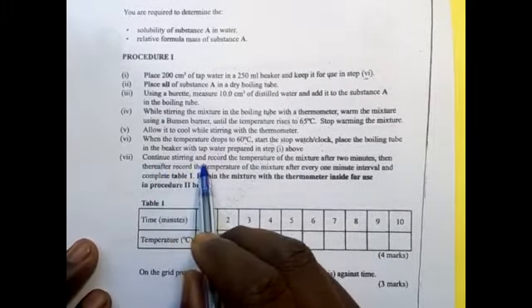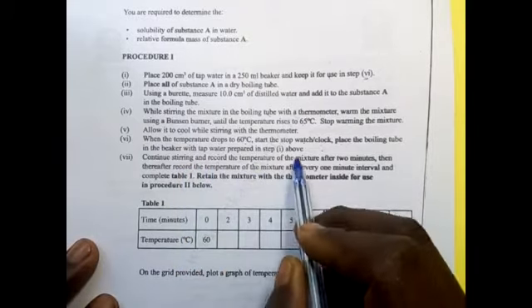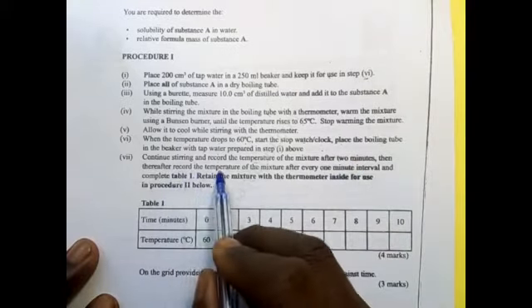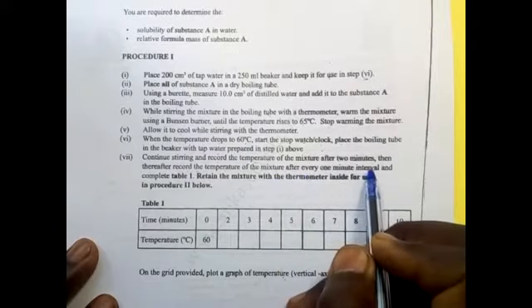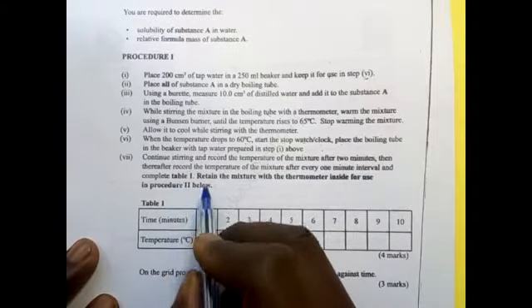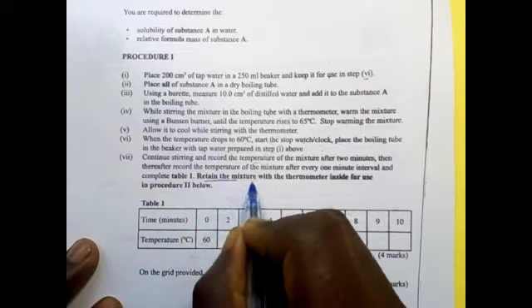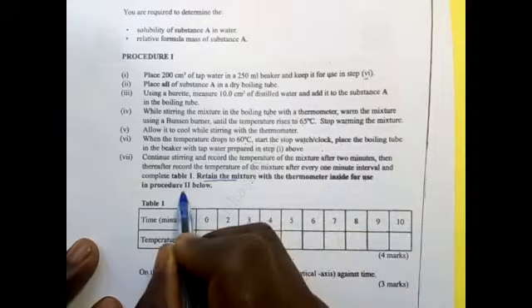Continue stirring and record the temperature of the mixture after 2 minutes. Thereafter record the temperature after every 1 minute interval and complete the table. Retain the mixture with the thermometer inside for use in procedure 2.